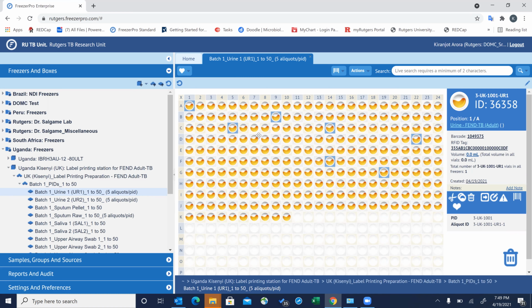these samples are still selected, and right now I'm not holding the shift key, but if I want to keep all of these samples selected and select further, let's say 3 more samples, what I would do is again press the shift key, hold it for a while, and then select more samples that I want to select.